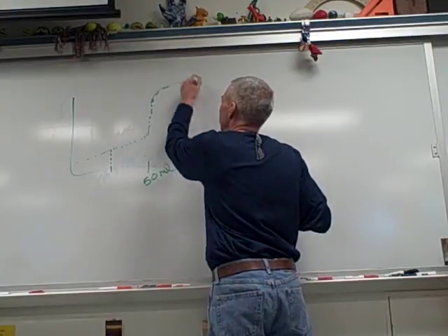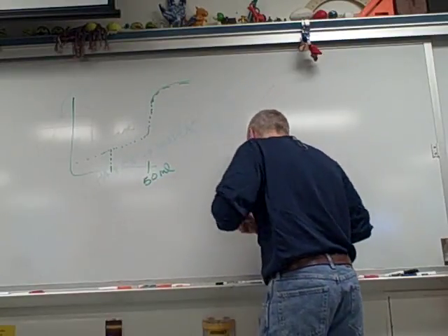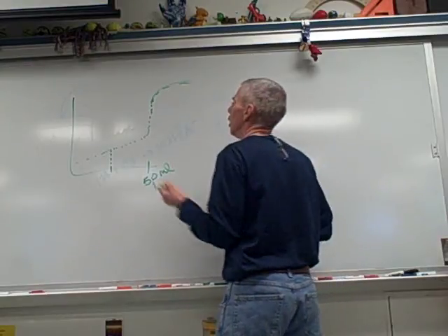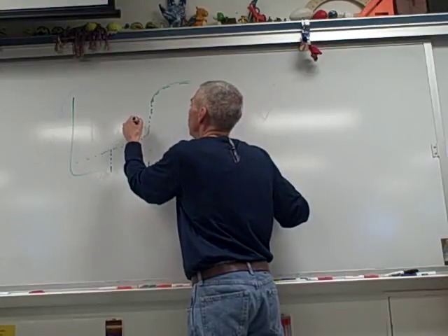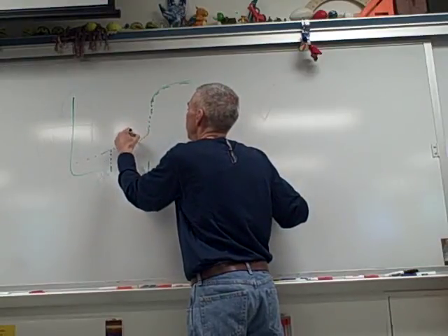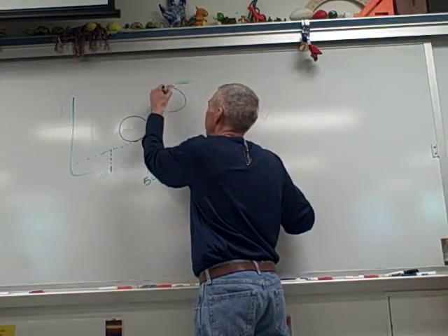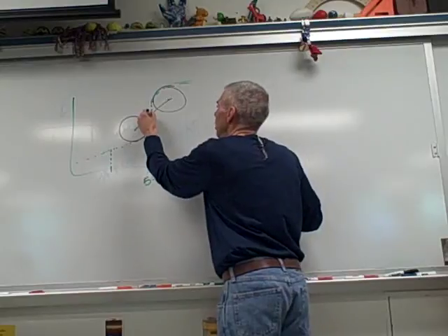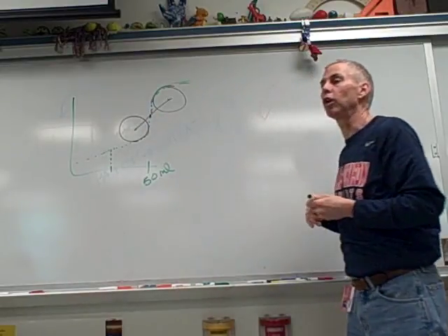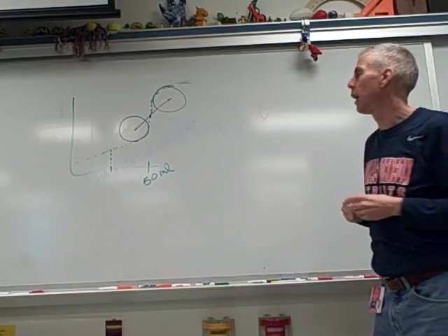Okay, last thing. How do you actually do this? There's a couple of ways to find it. Old school. Literally, I kid you not. We would take a paper graph, we would draw a best fit circle of this curve, a best fit circle of this curve, and draw a line between the 2 midpoints. That was the equivalence point. And it worked really well. Good thing we have calculators.